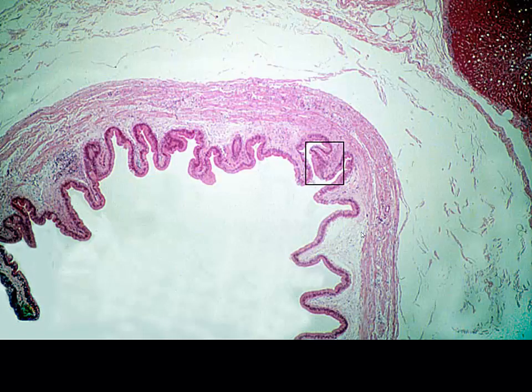Once again, as we're going higher and higher magnification, we can begin to appreciate that we probably have columnar epithelium. It's difficult to see if we have simple columnar, if it's possibly pseudostratified at this point. We'll take an even closer look. But certainly we have our mucosa, submucosa, and then our muscularis. And you can see the discontinuous smooth muscle in this layer before we get to our adventitia.